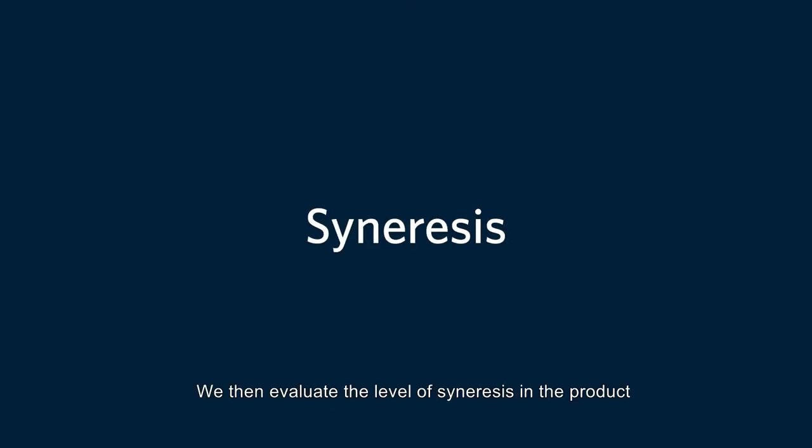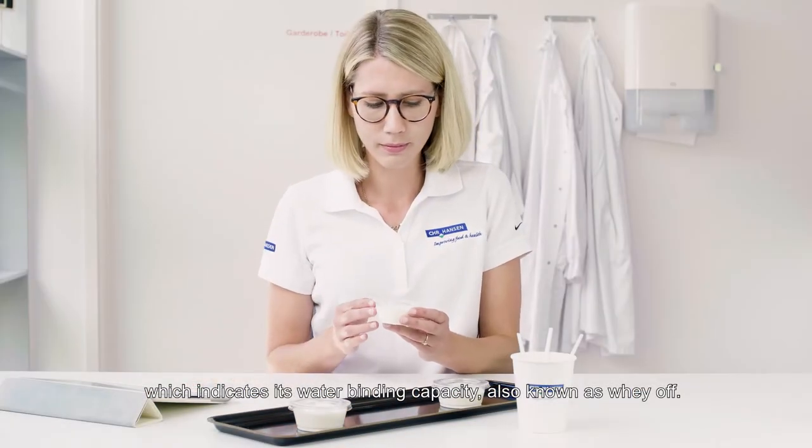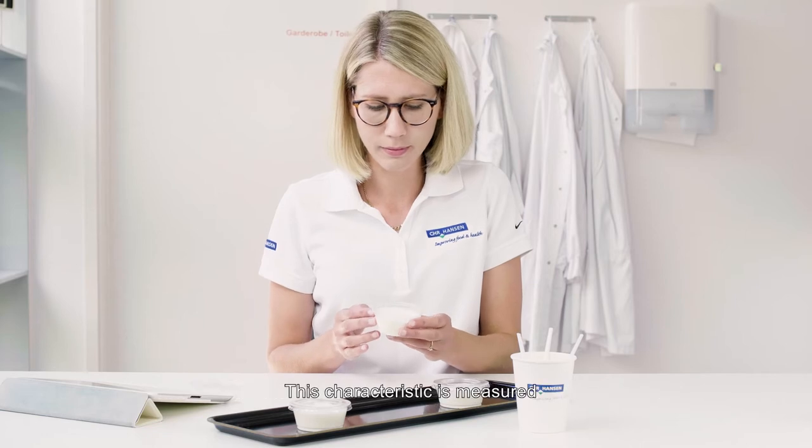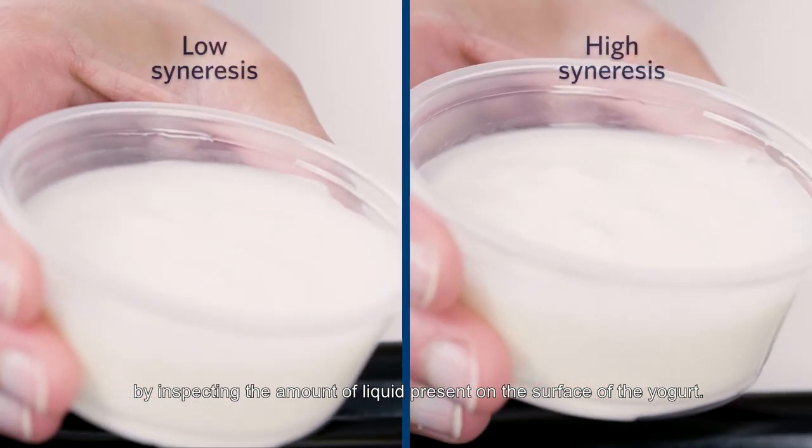We then evaluate the level of syneresis in the product, which indicates its water-binding capacity, also known as whey off. This characteristic is measured by inspecting the amount of liquid present on the surface of the yogurt.